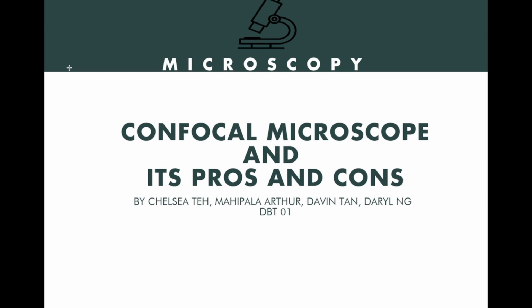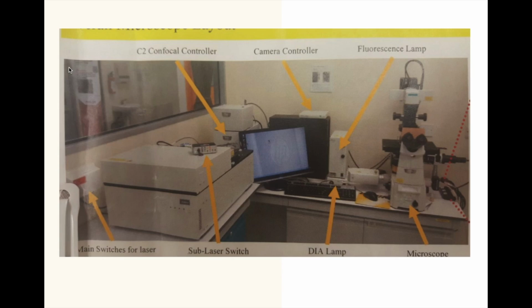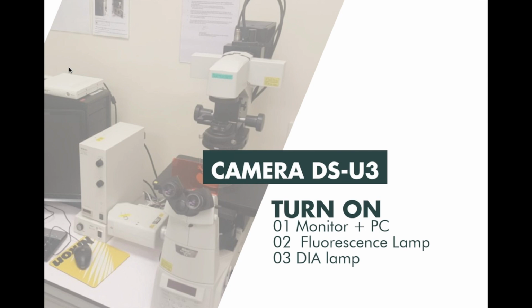Today we will be talking about how to use the confocal microscope and its pros and cons. This is the setup of the entire microscope. Now we will show you how to use the microscope.